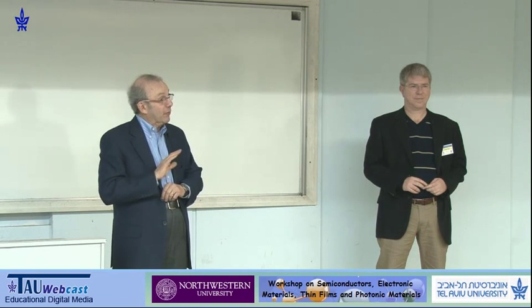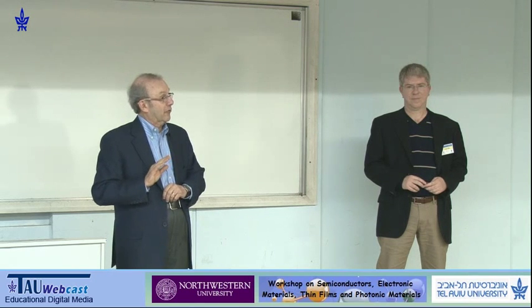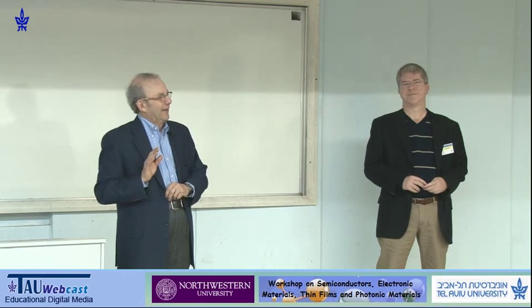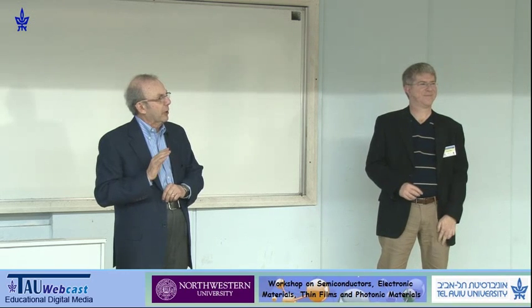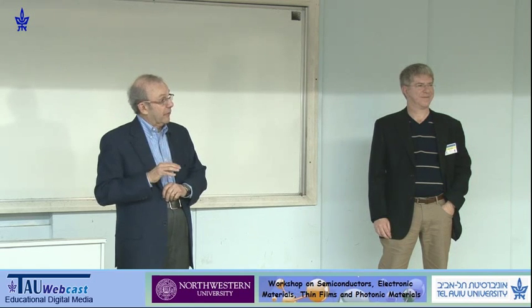Even though we had beautiful FIM images from it, beautiful ones, they would not touch it, of course, because, it's human nature, they could get huge data sets in a few hours. It's like going to the synchrotron, where in a day or 2 days you collect a tremendous amount of data and then you spend a lot of time analyzing. It's the same thing here.